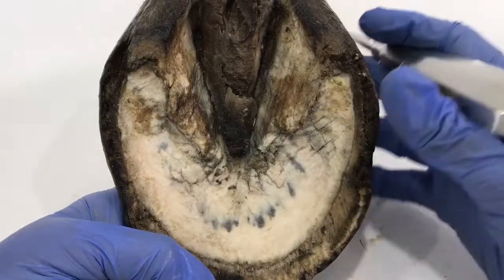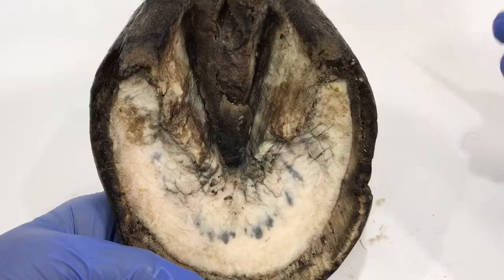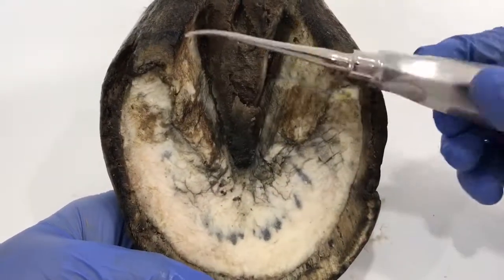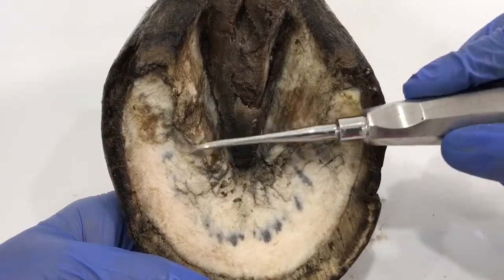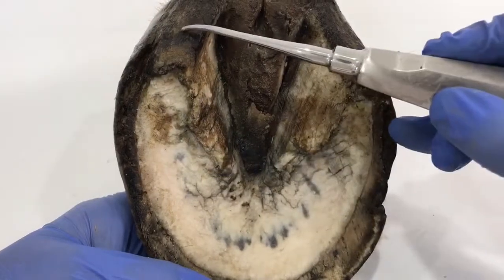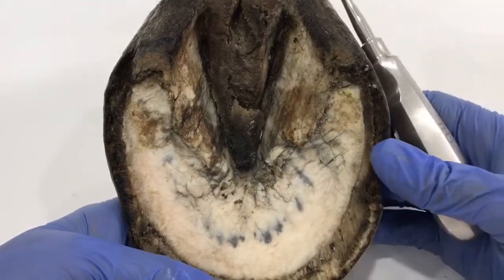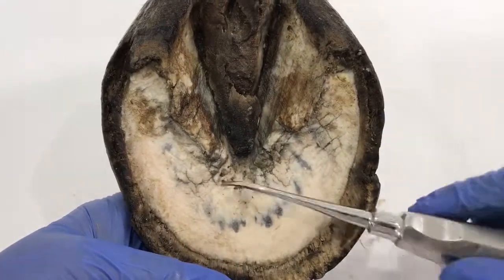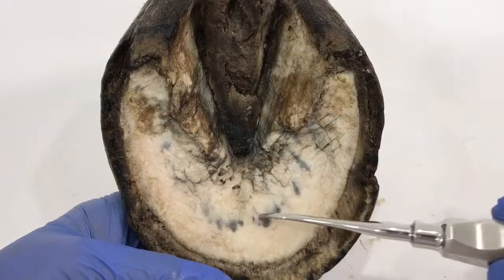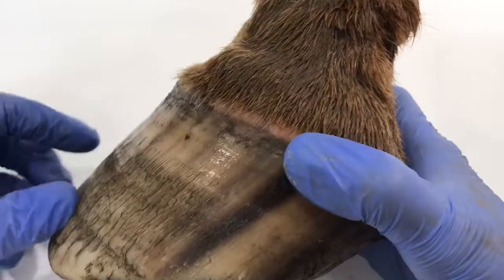My plan is to do a sagittal section through here so we can look at halfway through the foot — the typical presentation you see in textbooks. Then I'll take sections through here to look at what's going on with the bar and how far it's going over the sole. We can also look at the damage through the back, the heel area, and get a better look at what's happening with the frog. By sectioning through here we can also get a better look at this pigment.